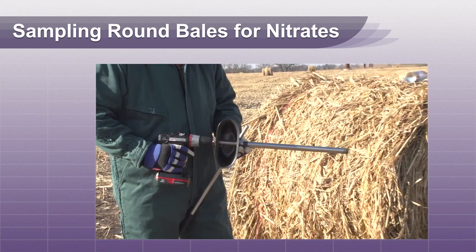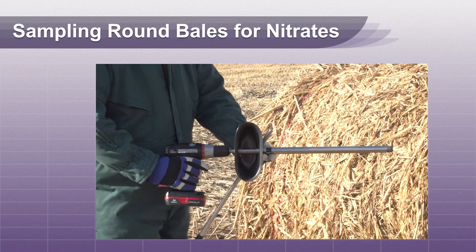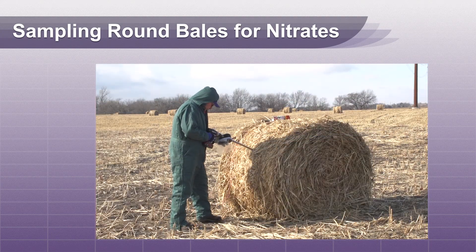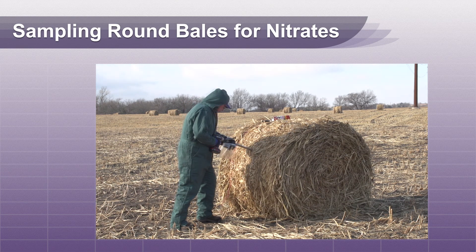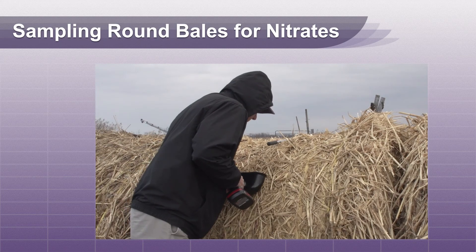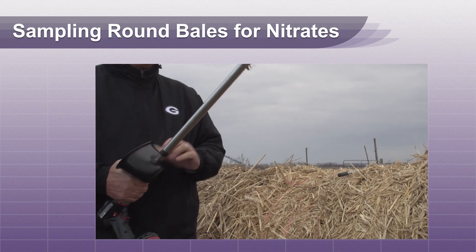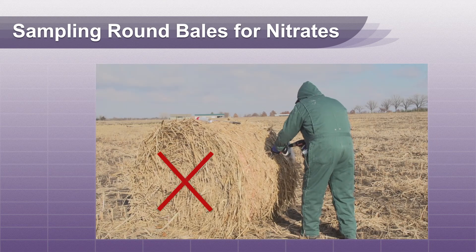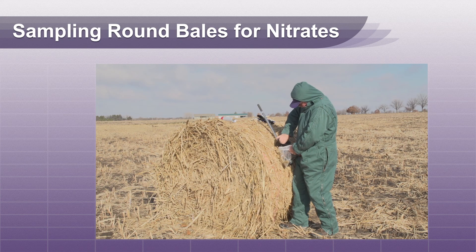A good quality bale coring instrument adds to the ease of this procedure. This one mounts to a drill and it's simple to use. Make sure the end is sharp and coring is done in low gear for more torque. Place the bale corer in the middle of the bale on the round surface. Sample the bale as far as the probe will go in, as this will sample many layers of wind row that has been rolled into the round bale. Do not core the bale from the end where the bale surface is flat, as this will only sample one area of a single wind row.